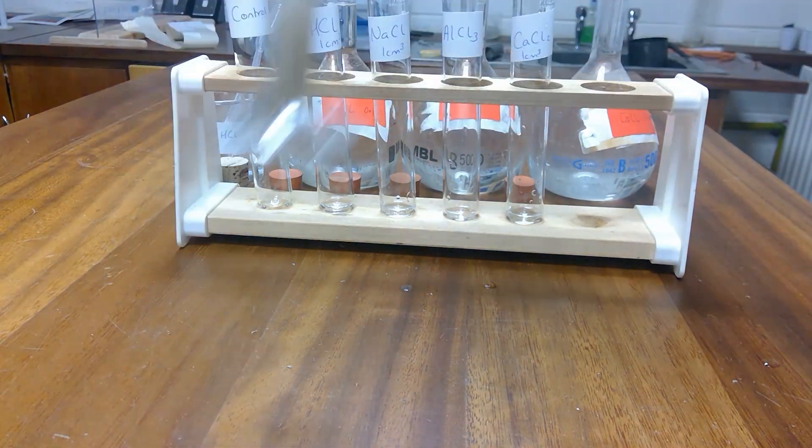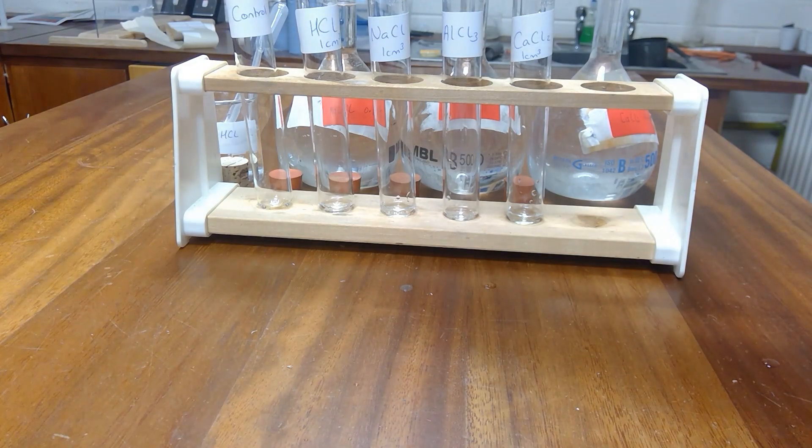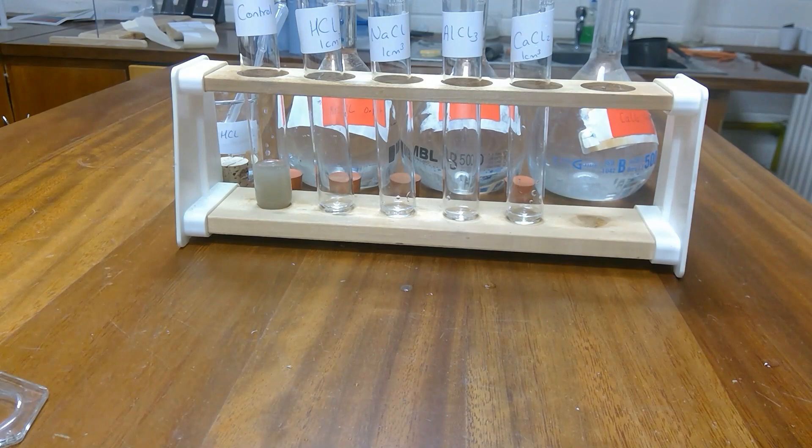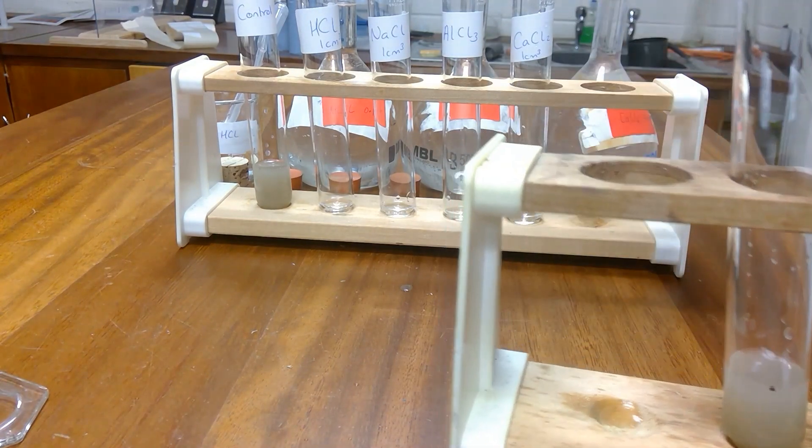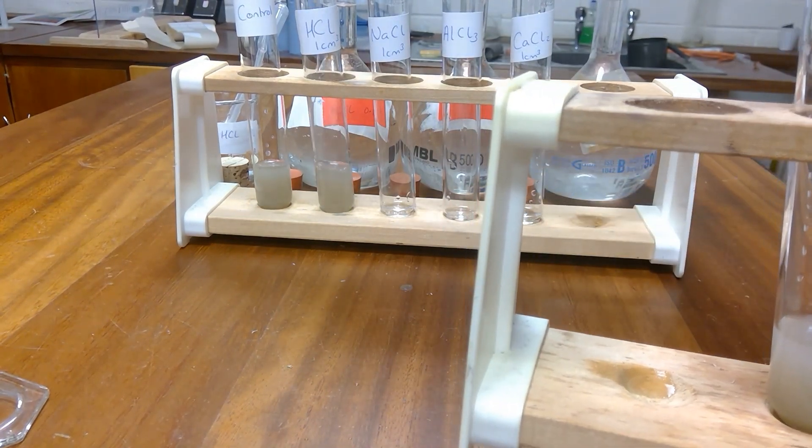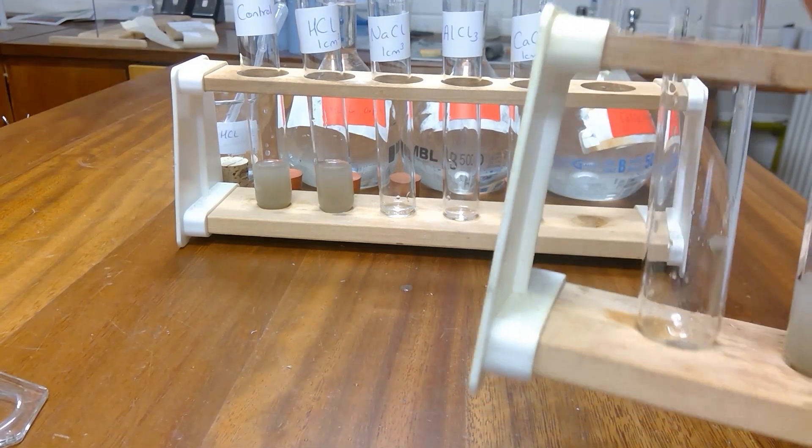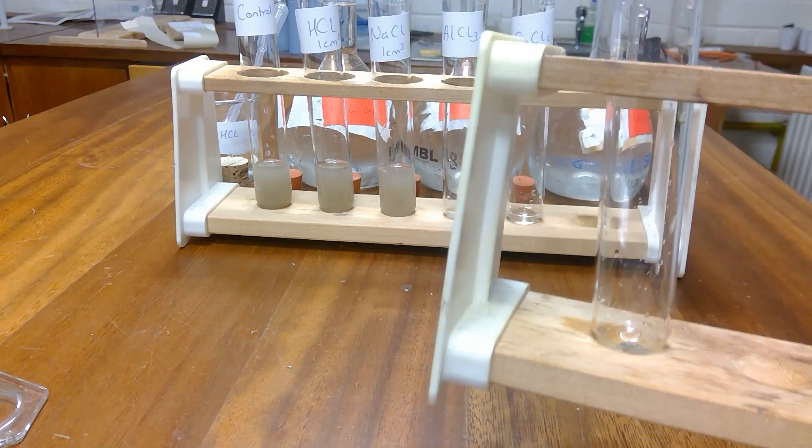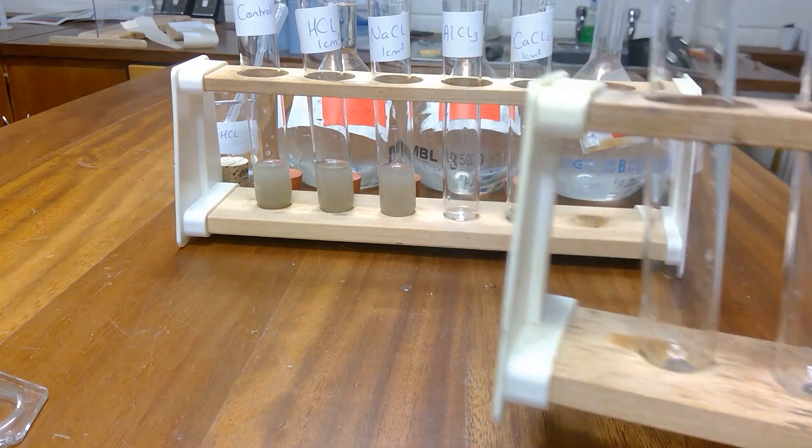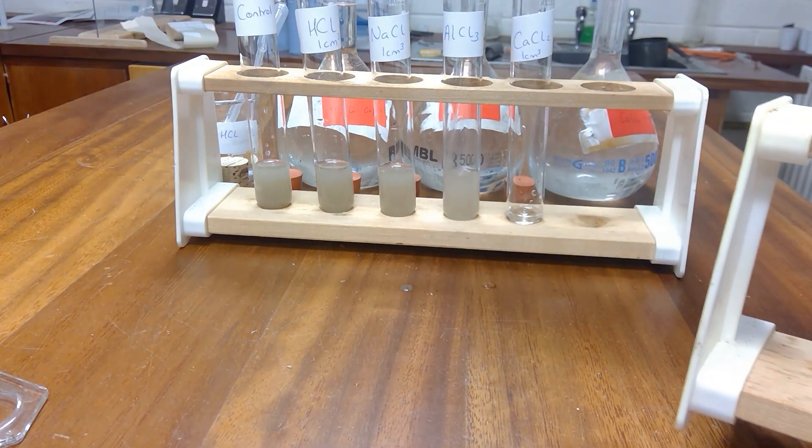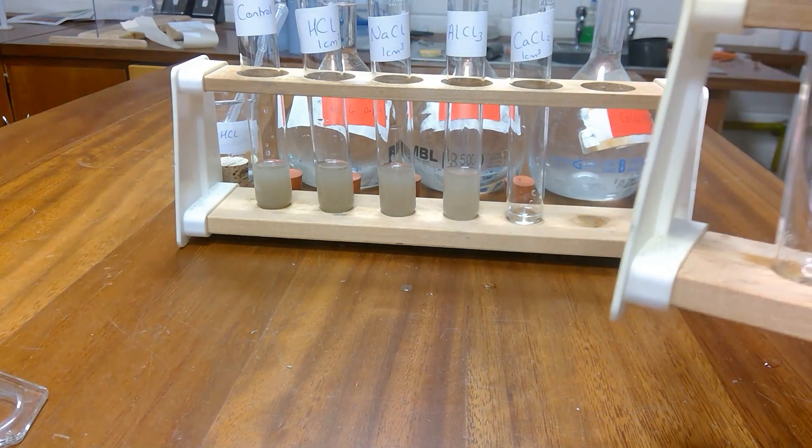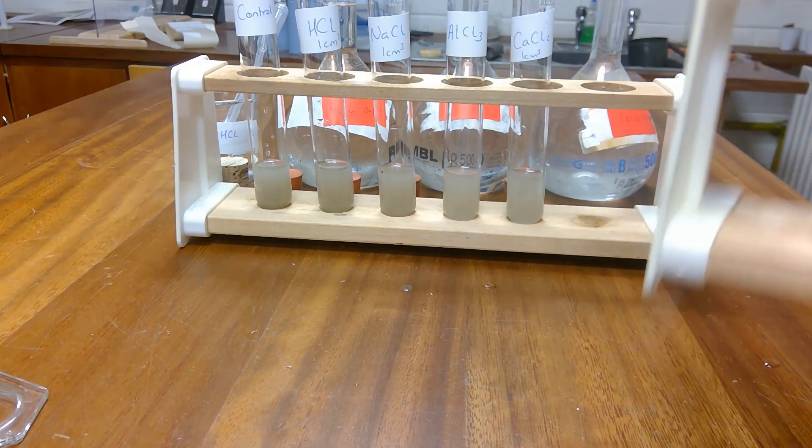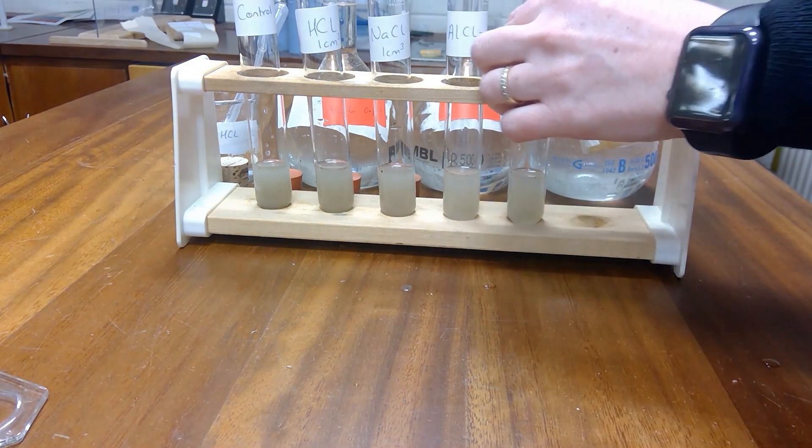So now we've placed the 10 centimetres cubed into the control of our clay soil. And I have some prepared already. 10 centimetres cubed of the hydrochloric acid. 10 centimetres cubed into the sodium chloride. 10 centimetres cubed into the aluminium chloride. And 10 centimetres cubed into the calcium chloride. And we'll put the stoppers on each.